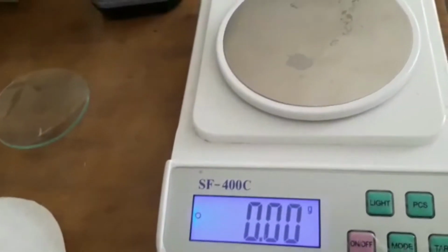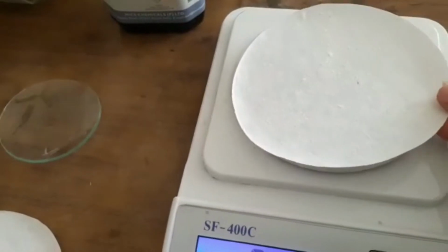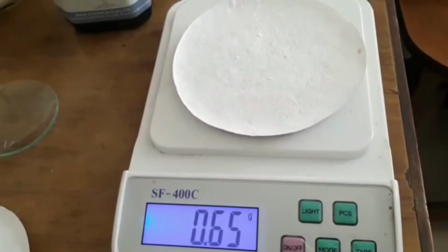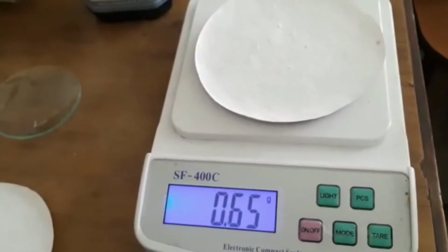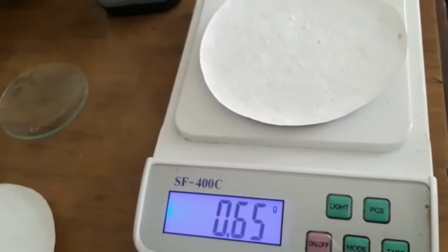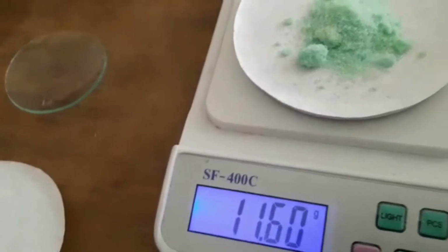This is our weighing balance showing 0, and now I'm going to put on this paper to start weighing. You should prefer to use glazed paper or watch glass. Now this weighs 0.65 and we need 12 gram of ferrous sulfate. So we need to make it 12.64.